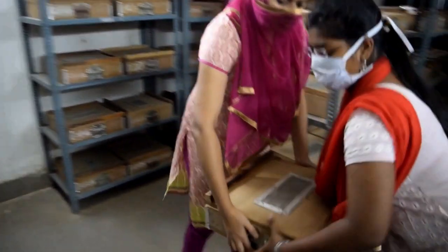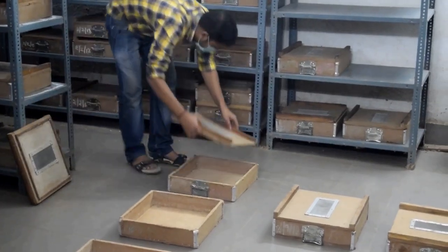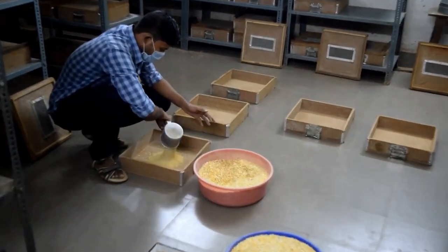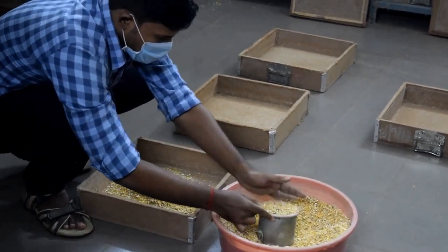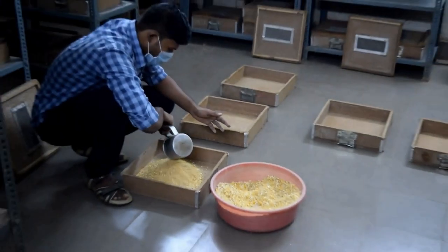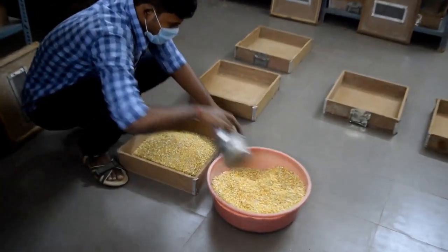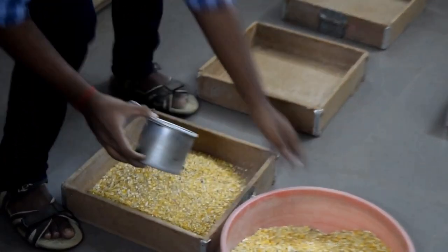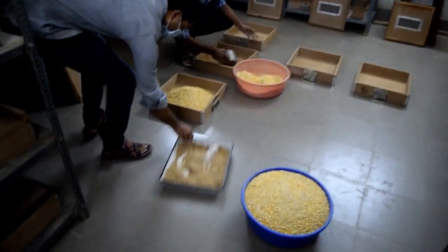Rice moth rearing boxes are being prepared. In each box, 2.5 kg of crushed maize grain and 100 gram of roasted groundnut kernel is added. During treatment in hot air oven, the maize grain and groundnut kernel lose moisture.